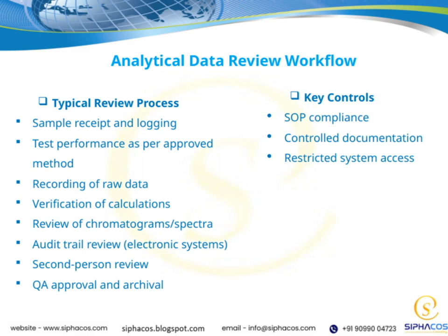Moving on, the analytical data review workflow is a structured process that guides us through reviewing data systematically. The typical review process begins with sample receipt and logging, ensuring everything is accounted for right from the start. Then, tests are performed following the approved methods to guarantee validity. Raw data is meticulously recorded, forming the foundation for all subsequent evaluations. Calculations are verified to prevent errors, and chromatograms or spectra are reviewed carefully to interpret the results correctly.